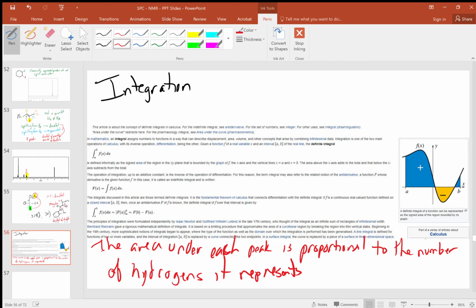So often, and this is something we'll go over more in lab, there are two straightforward ways to fix it. One is that if you know how many protons any one given peak in your molecule represents, you can use that as a reference, assign it, and then everything will be calculated relative to that.